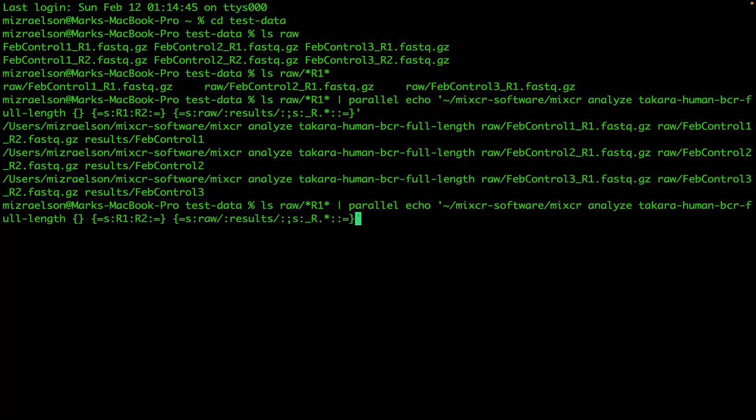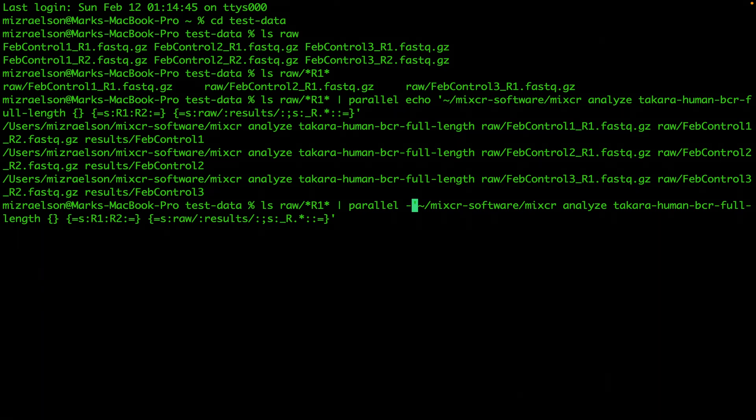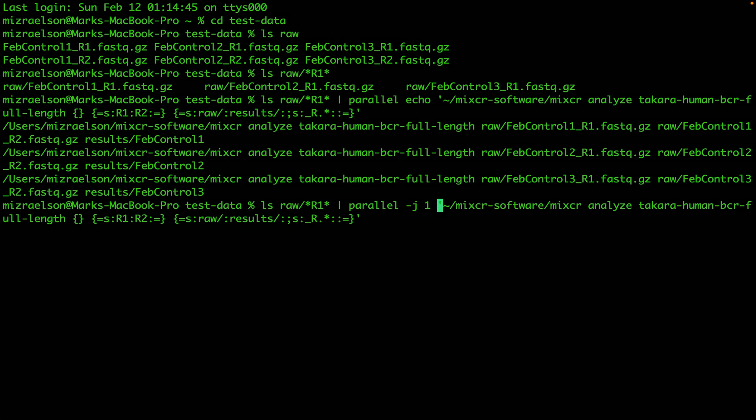Now to run these commands one after another, I just have to delete echo. Then I also want to use two parameters. The first one is -j, which sets the level of parallelism. Because I work on my home laptop, I want to set it to one so the samples will be processed one after another. If you work on a more powerful machine, you can set it to three and then all three samples will be processed simultaneously and it will take less time.